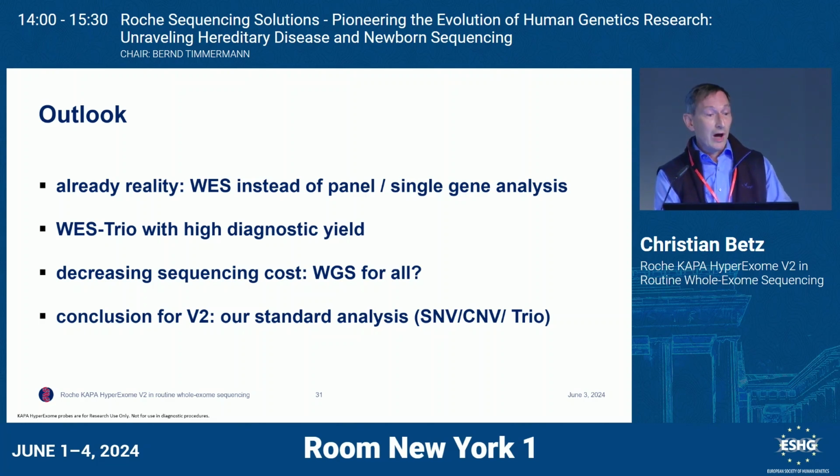So where are we currently with doing this kind of exome analysis? We are already there that exome analysis replaced previous panel or single gene analysis. We do one stream, one really streamlined workflow in the lab for all these kinds of analysis. Our trio analysis really has a high diagnostic yield.